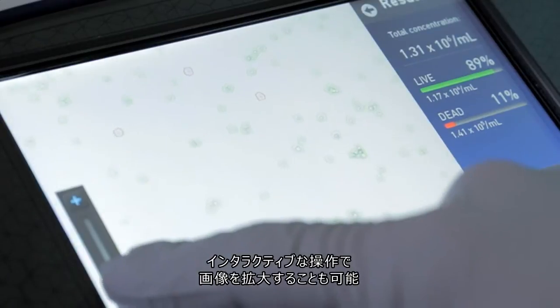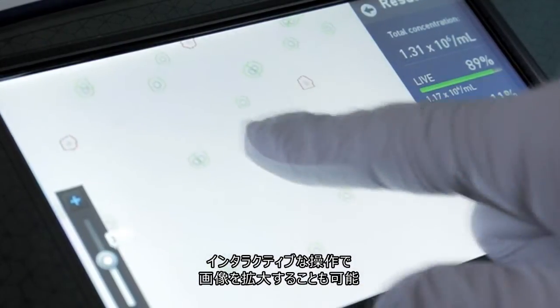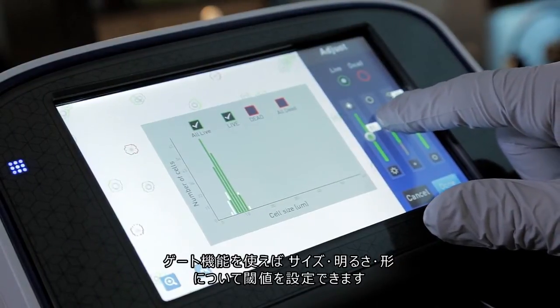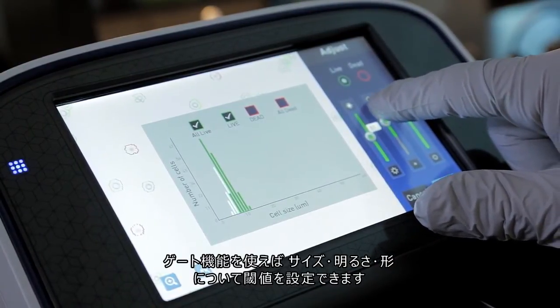The interactive screen allows zooming in on the image to get a closer look at the cells being counted. The gating functionality allows cells to be counted or excluded based on size, brightness, or circularity.